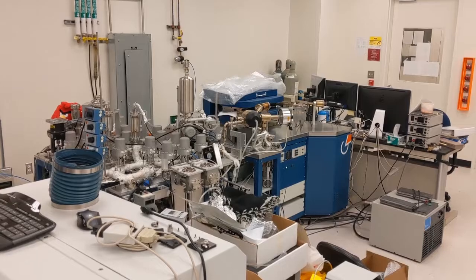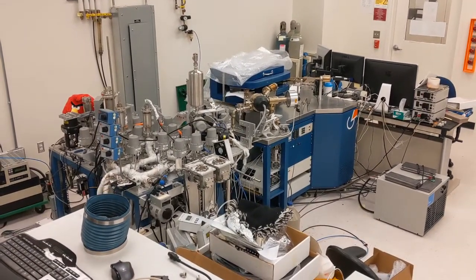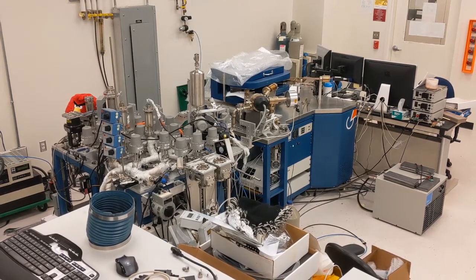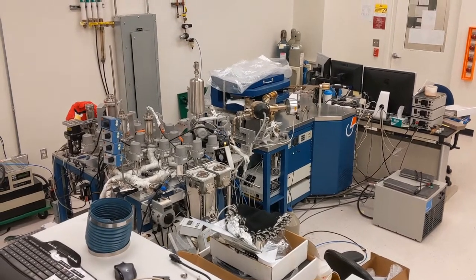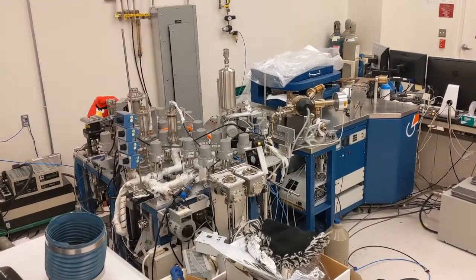The instrument you are now looking at is a magnetic sector noble gas mass spectrometer, a high-precision tool for the separation of isotopes by mass. For example, this instrument is able to separate helium-3 ions, an isotope of interest to us, from ions of hydrogen deuteride, a species with the same cardinal mass as helium-3, which we wish to avoid measuring.